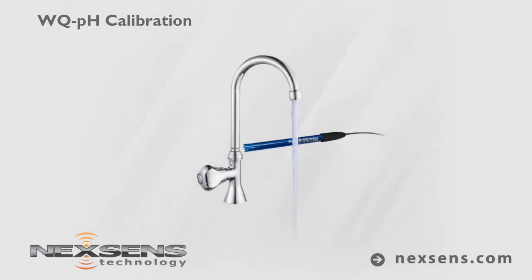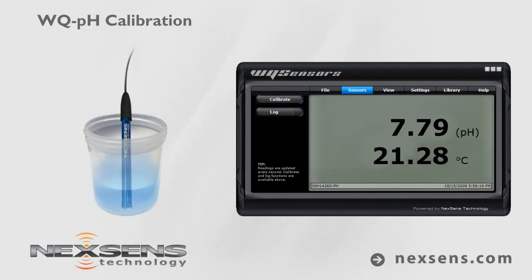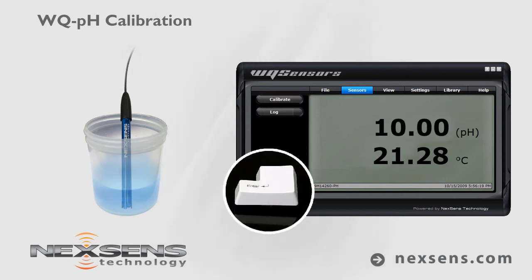Rinse and shake off any excess water. Submerge the probe in pH 10 buffer. Again, wait for the reading to stabilize and press the calibrate button. Adjust the value to 10.0 and press enter.